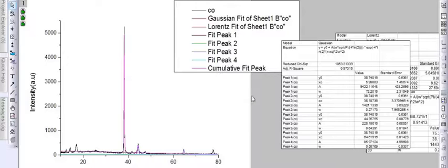If COD, that is the R square, is not close to the value of 1, suppose the value of the COD is coming around 0.04, then we have to first smooth our XRD data and then again do the fitting. So this point you have to make sure. This is all about finding the peak position and FWHM.